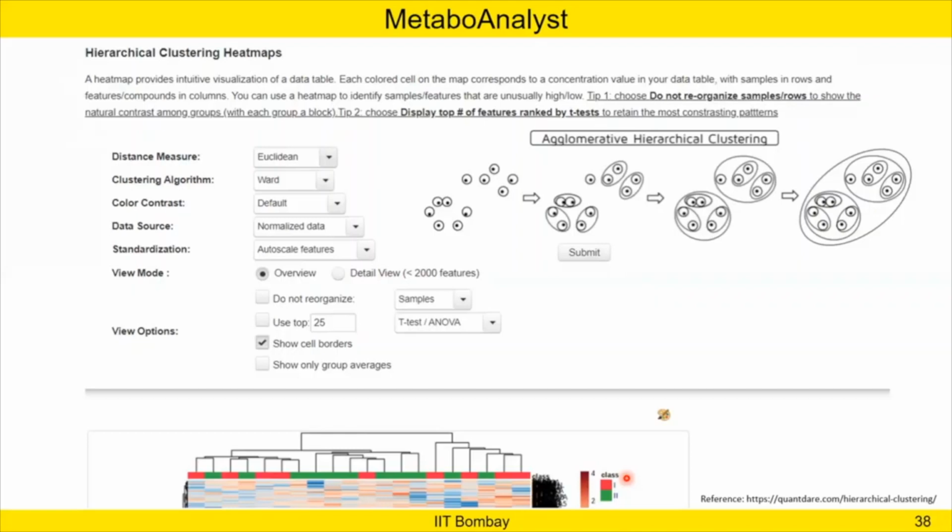There is another clustering technique known as divisive clustering, which will take all the data points into account as one group, and then start the clustering. But over here, agglomerative clustering works bottom up. That means it will take each sample into account and then start forming small clusters. That means the samples which, on the basis of the features, come close to each other, on the basis of that it will give the clusters of the samples.